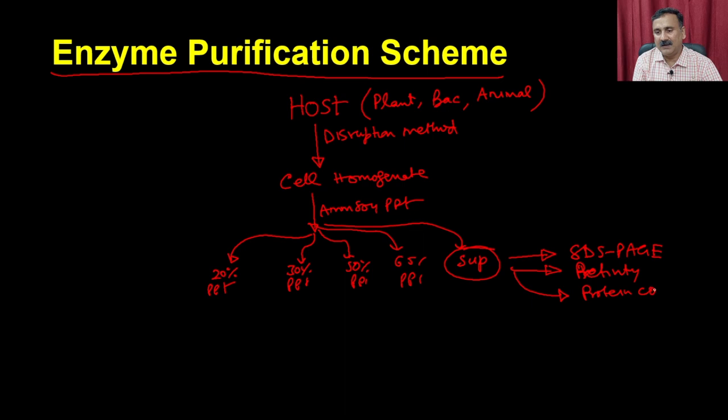Okay, and that is actually going to be a guiding force whether the purification is going in the right direction or not. Because if you are doing some procedure and it is giving you no activity, for example, there will be an activity loss, then the purification is not good actually. So then you have to modify the scheme.